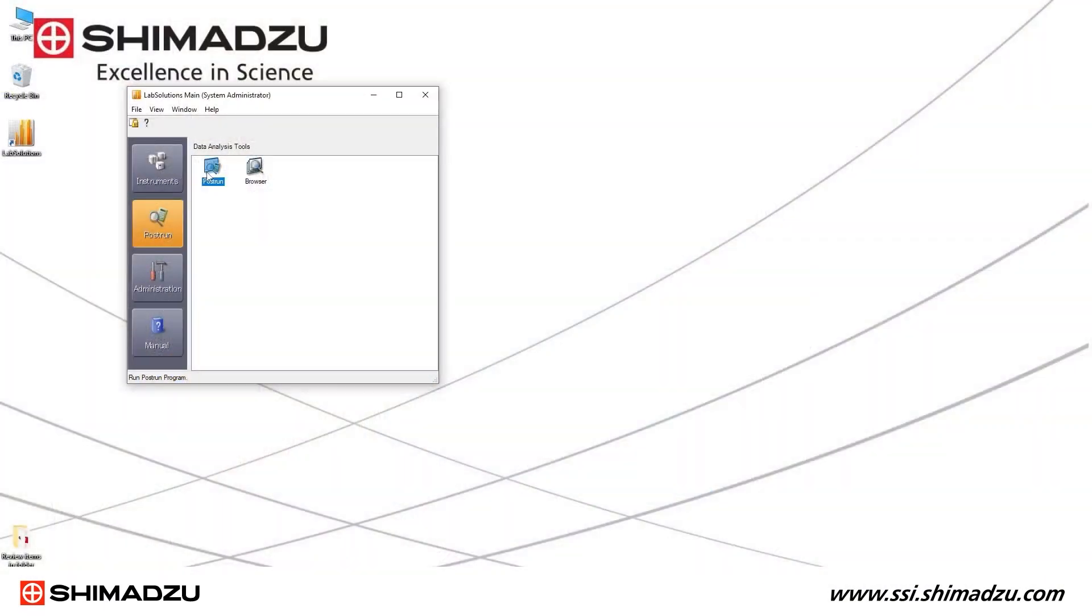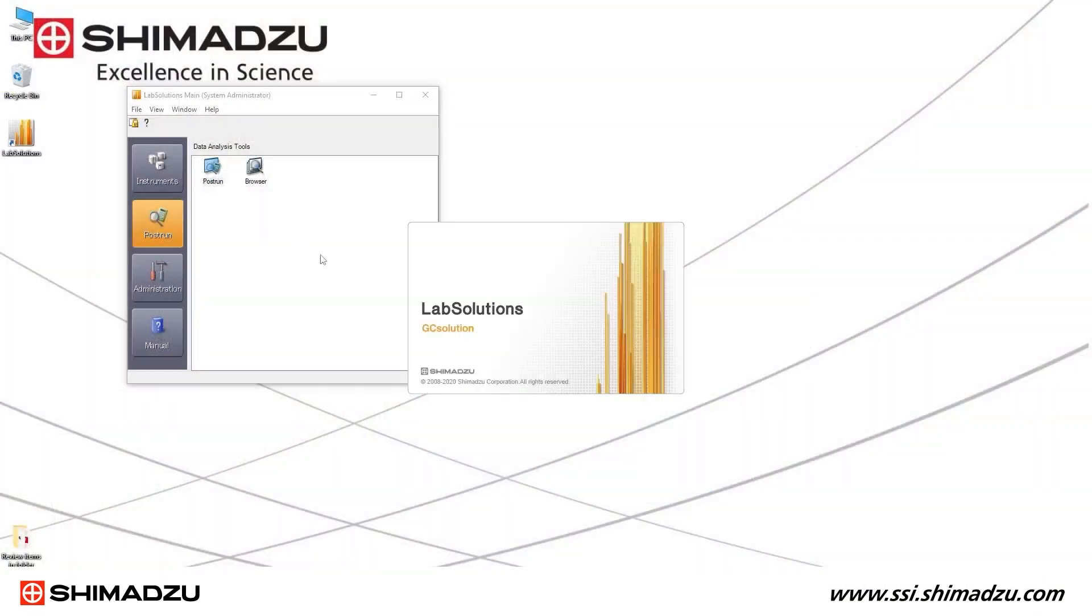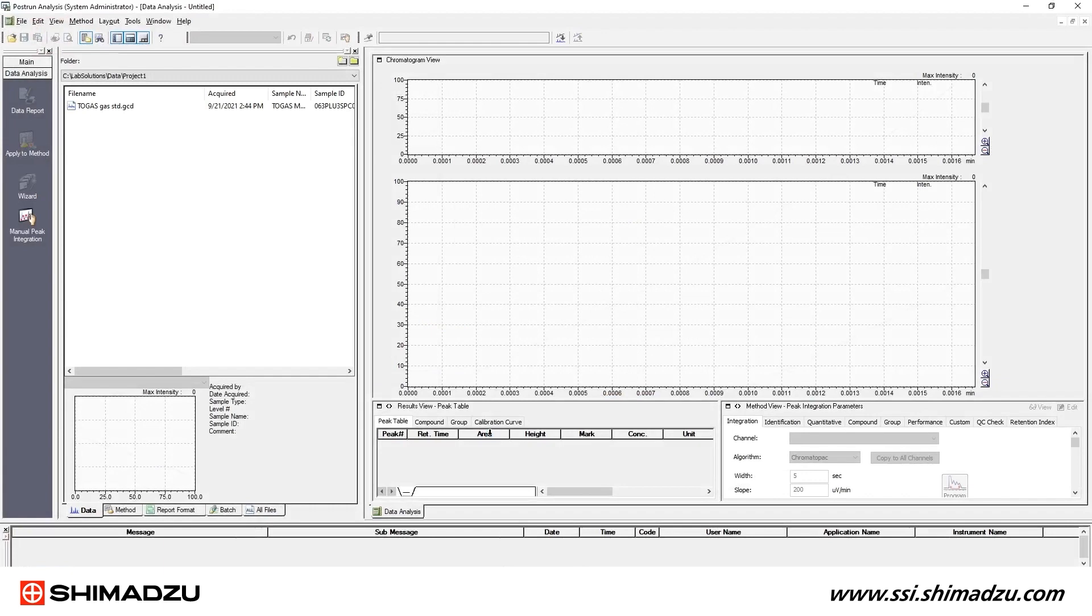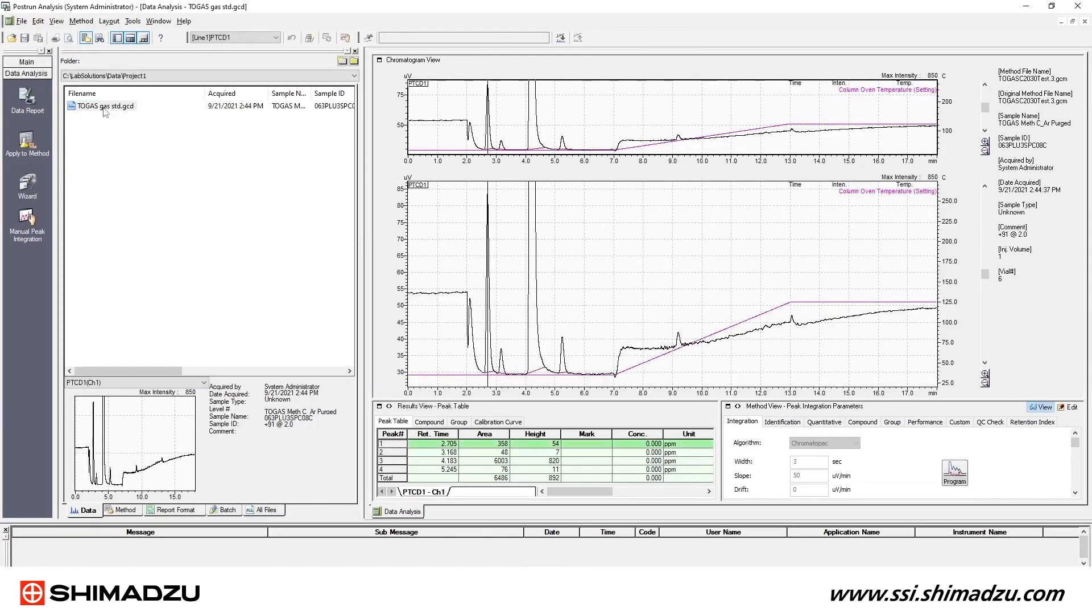Start the LabSolutions software post-run and open the folder where your data file is stored. Double-click the data file to open it in the data analysis window in LabSolutions.